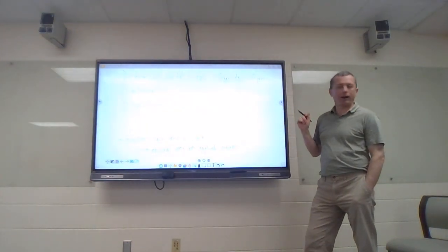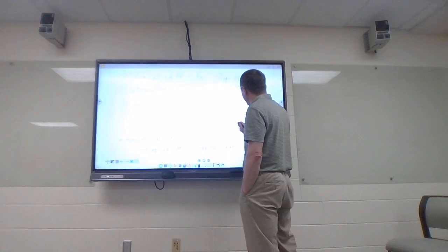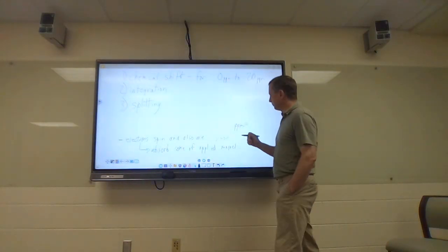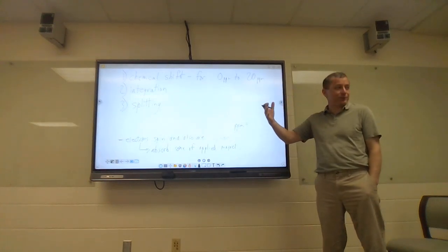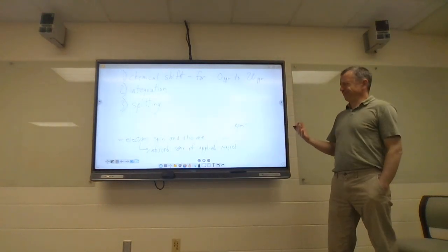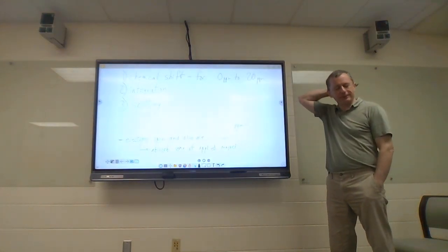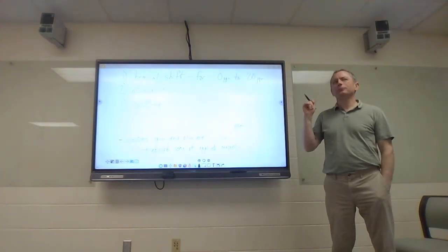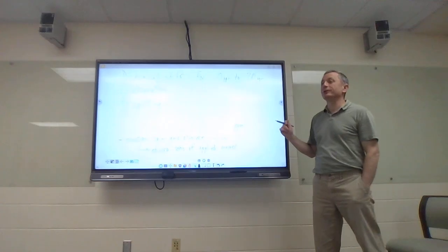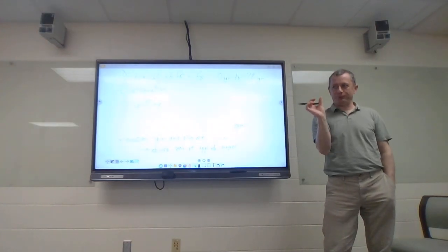What's a ppm? It's an interview, and somebody asked me, "Oh, so is ppm you're talking about in NMR?" It was a non-chemist. ppm in NMR, is that like the same as concentration? And I'm like, I'm not talking about concentration. I know ppm concentration of a solution, but I don't think so. The organic chemist who came with me after, it is. And I'm like, well, now I know that because when we report certain things from the NMR, we have to do it in hertz. Hertz is the frequency of the radio wave.